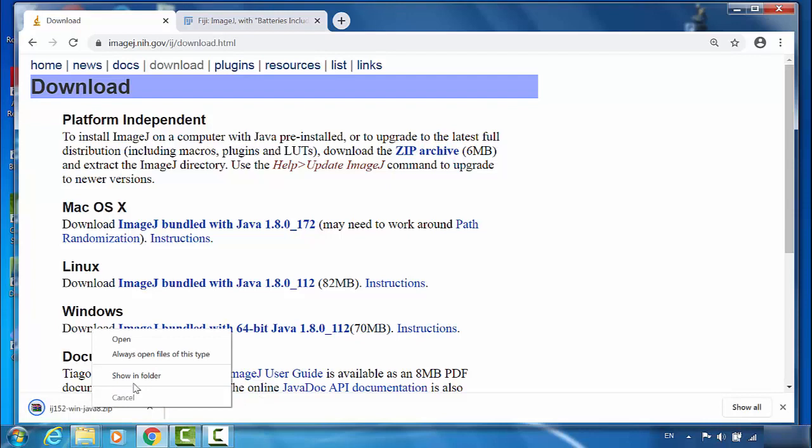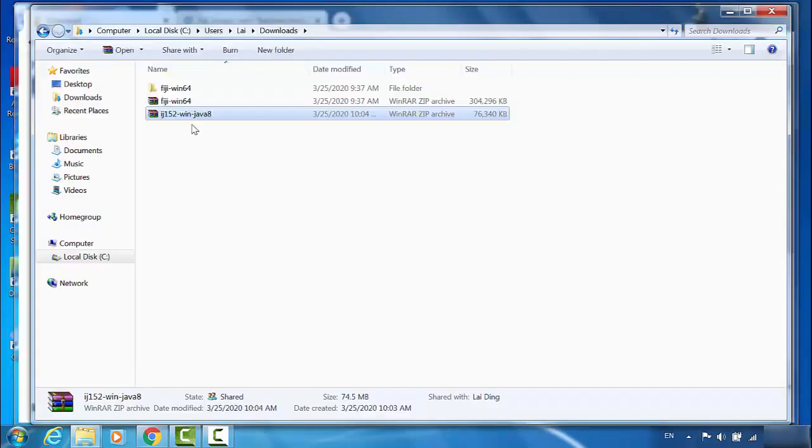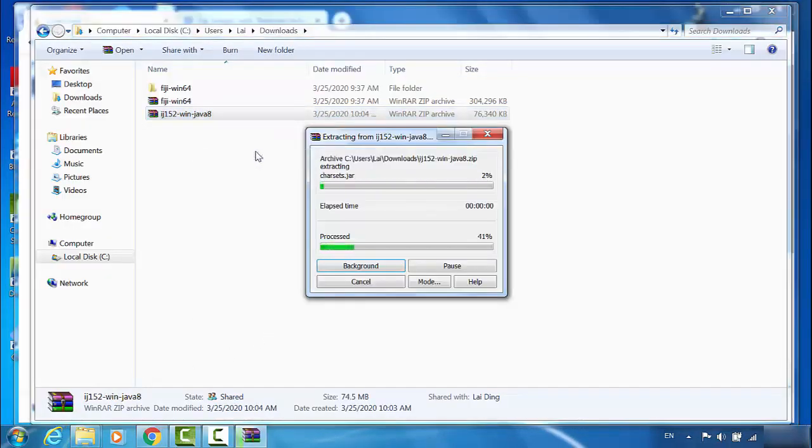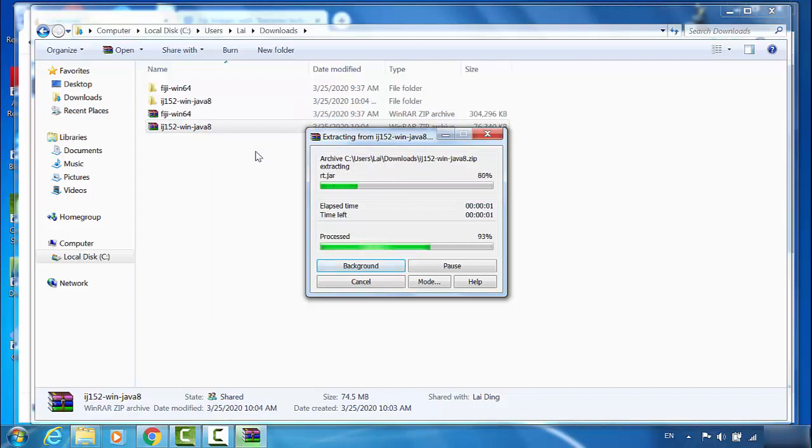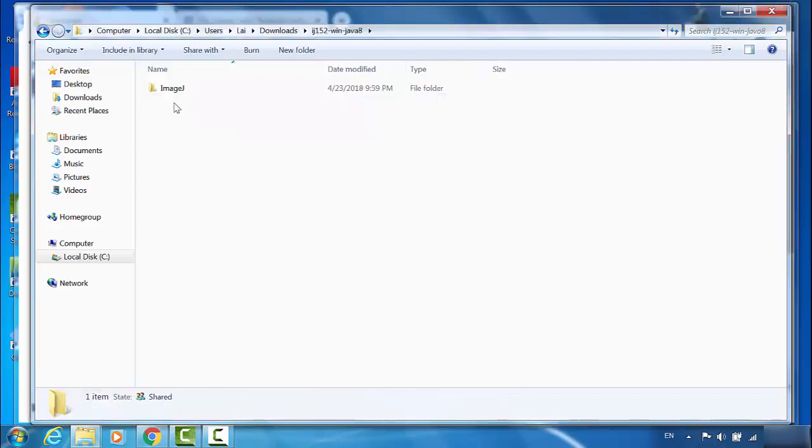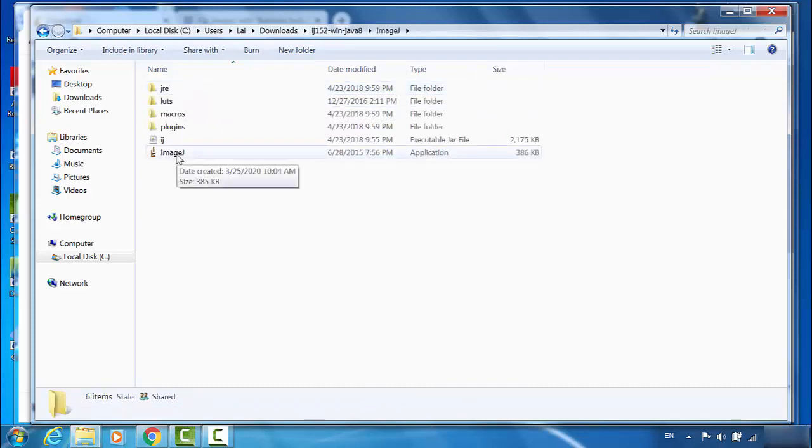I will open this in the folder. Extract it. It goes into here, ImageJ. This is the ImageJ program.